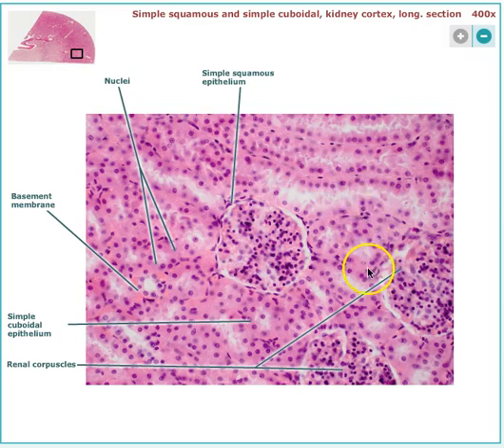So they're not complete cubes, like perfect cubes, but you see they're cube-like. And also what lets you know that you're looking at simple cuboidal is going to be this opening here, because they tend to form circles. You see that? Okay, so moving on.